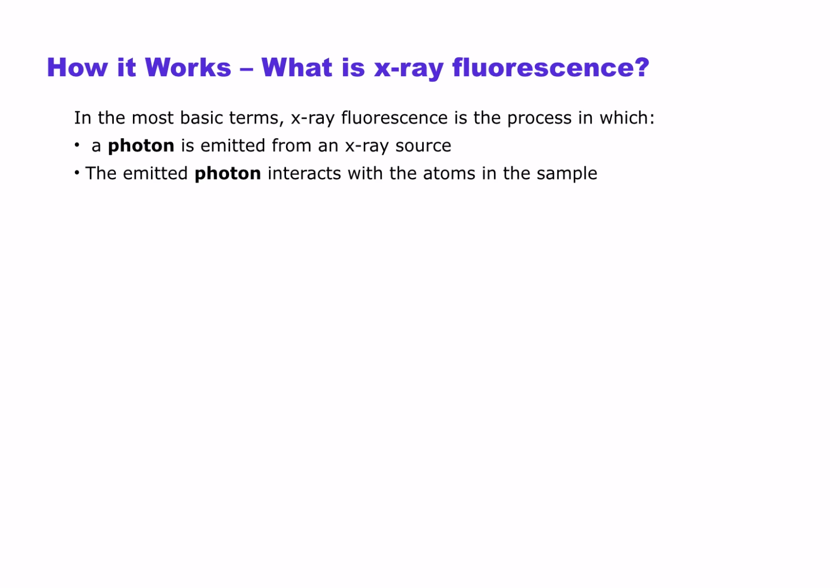And I cannot stress this enough, atomic information. If you have an XRF device that is giving you numbers for oxygen, for example, that's not a molecule. You do not see the oxidized state. Iron pyrite, hematite, and the two different states of iron oxide will fluoresce identically to each other. It's not a function of the molecule, it's a function of the physical number of atoms present for that given element. So if you do see results that report as oxides, take them extremely critically. There is no actual verification using X-ray fluorescence that a sample is an oxide.